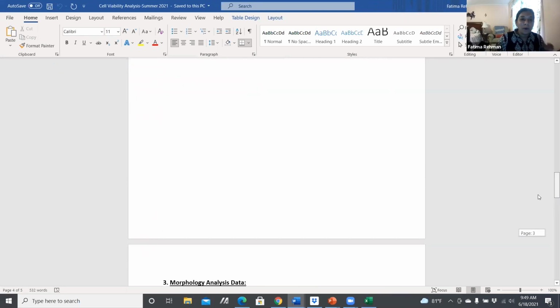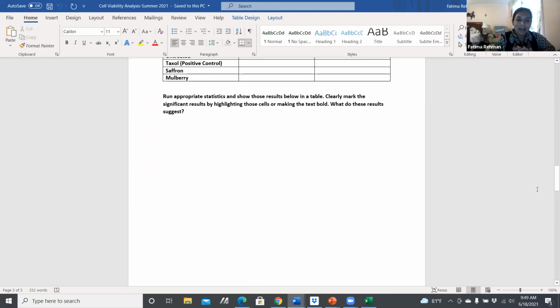So what I want you to focus on, how about that? I'm going to put you in your breakout rooms and you'll have till 10:30. What I want you to focus on is getting your relative growth and the trypan blue numbers done by that time. At 10:30, we will reconvene and I will go through an example morphology image just to remind you how to do all those things, and then you can make those observations.